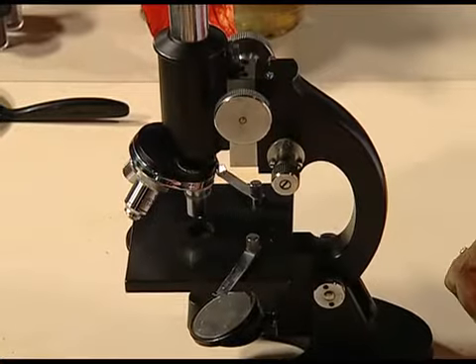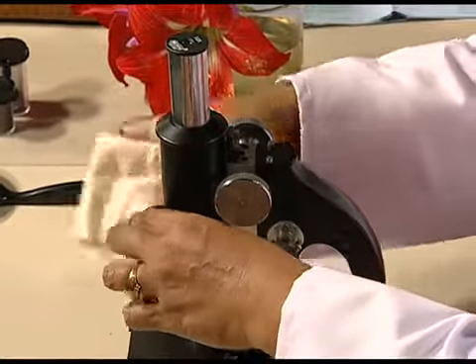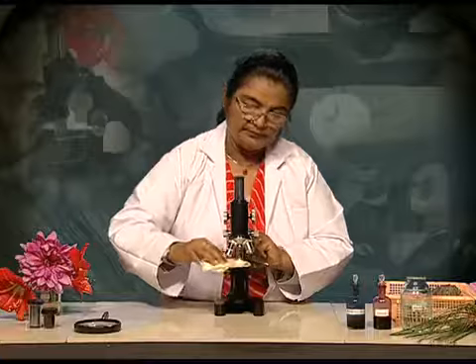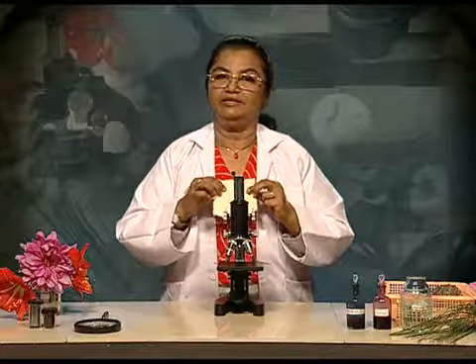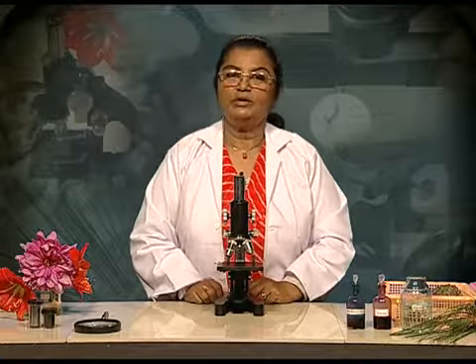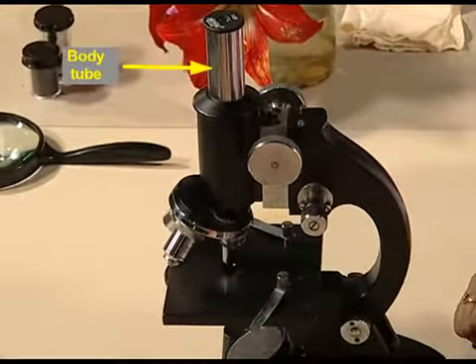Wipe the lens and stage. Use only lens cleaning tissue for cleaning, not any rough cloth. After use, lower the body tube so that the microscope fits into its box.